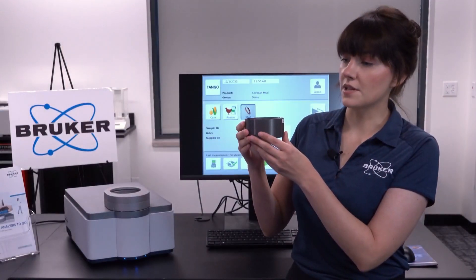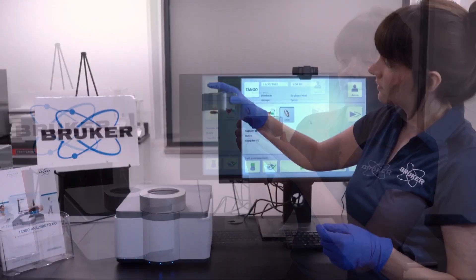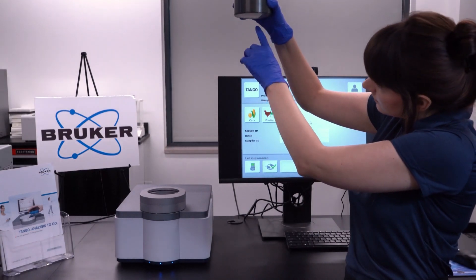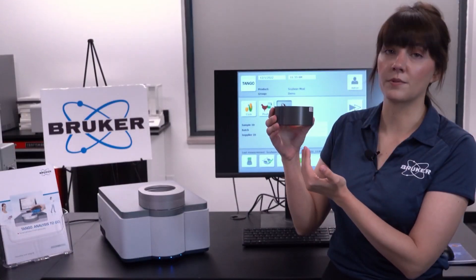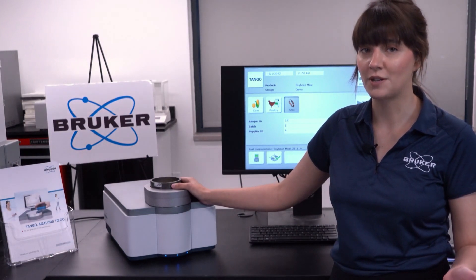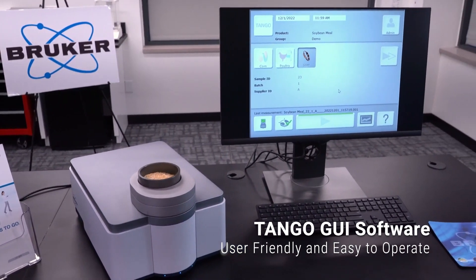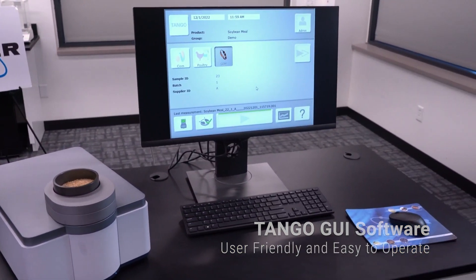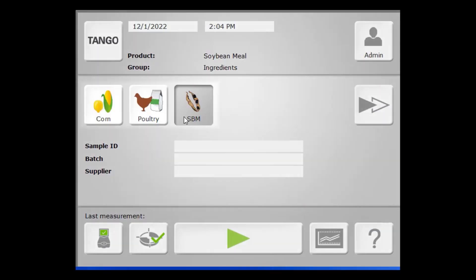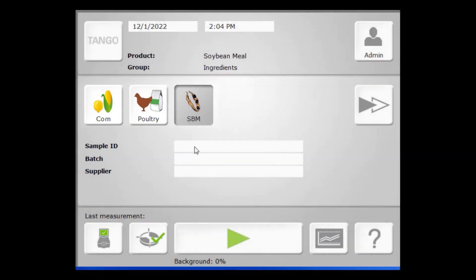We'll fill the quartz cup with enough that there is no light showing through to the bottom of the cup. You'll note that there is no leveling nor packing necessary, as the light from our instrument comes from below where the sample cup will sit. Now that we're ready to scan our sample, let's walk through sample measurement. When we're ready to scan, we select the appropriate product, input any identifying information unique to that sample, and simply hit go.